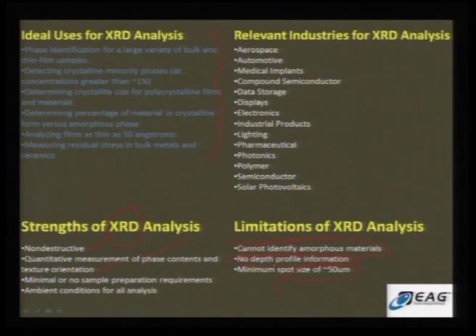Now, there are also several areas where X-ray diffraction has come into prominence. Relevant industries that use this analysis range from medical to electronic, and several others, which are using this as a fundamental tool to characterize the sample. I am going to talk in the next few minutes about some specific examples of how we can understand X-ray, and X-ray always goes in combination with some physical property where you can try to map some reasonable conclusions.